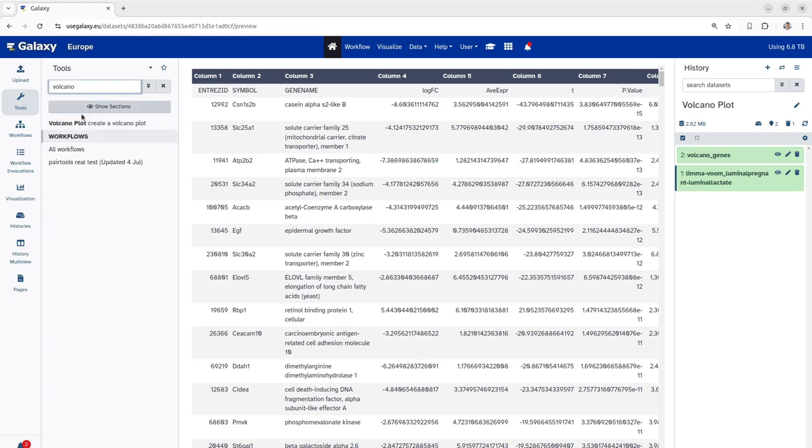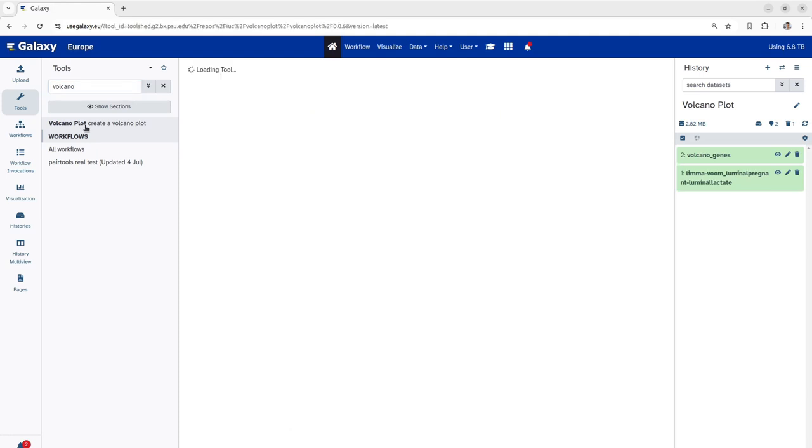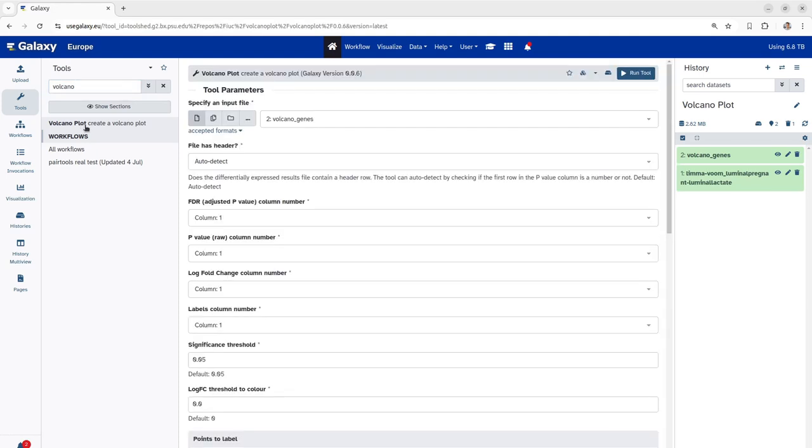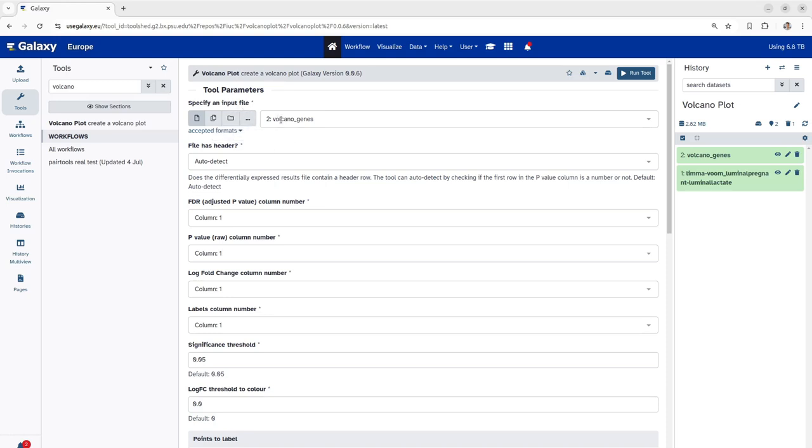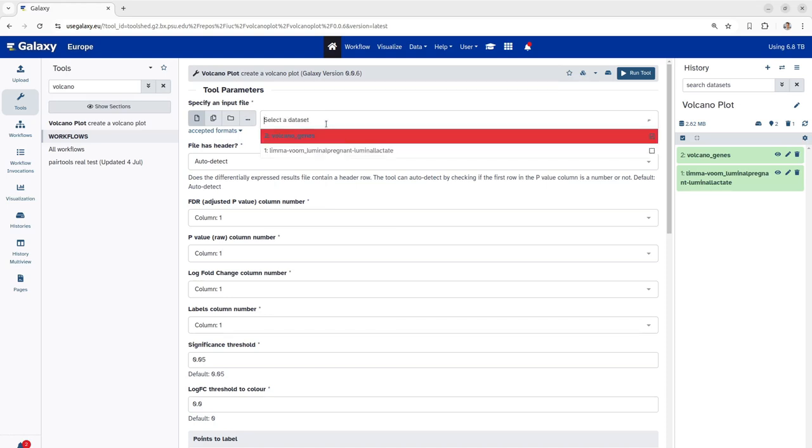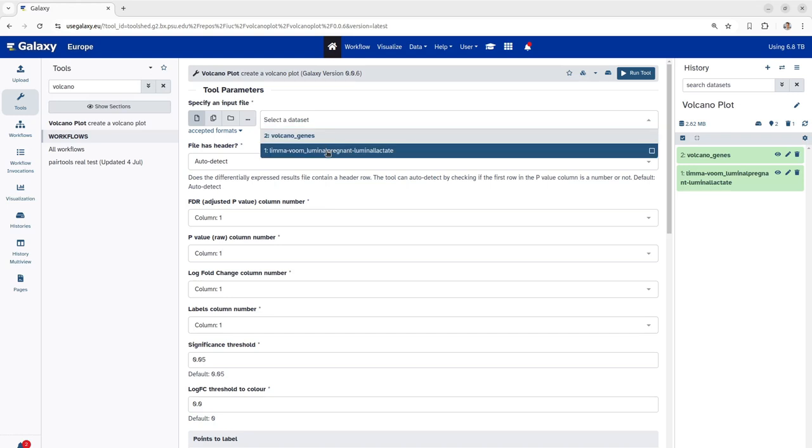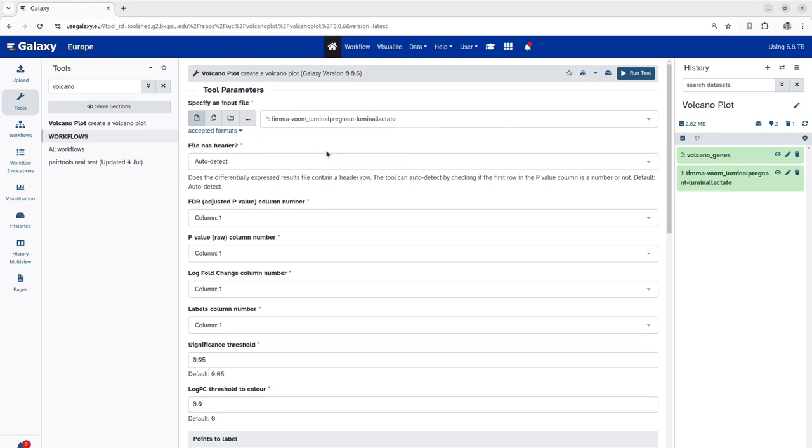As you can see, here we have our volcano plot tool. We click on this tool which gives us all the required parameters which this tool requires for creating a volcano plot. First, we have to specify the input file. In this case, we have to specify the differentially expressed gene results from the limma voom. So, we click to the limma voom file.